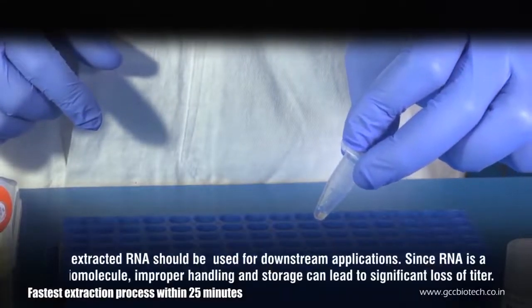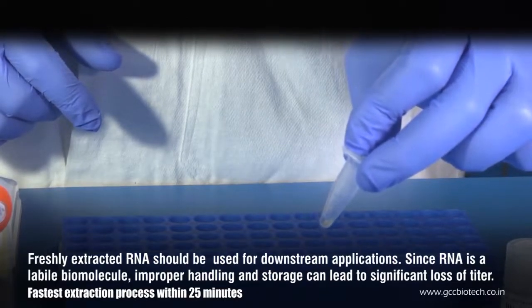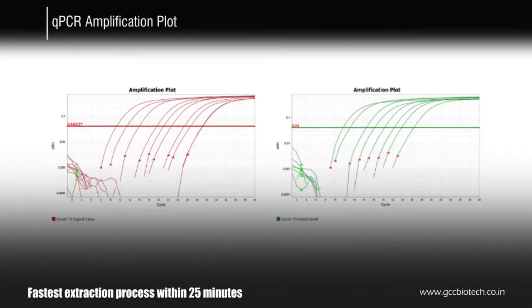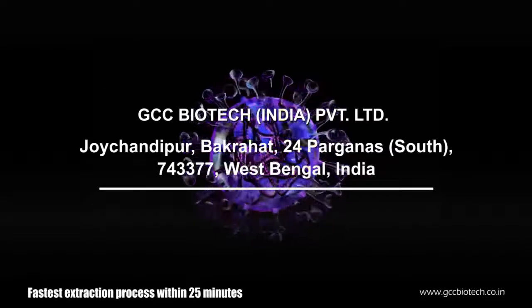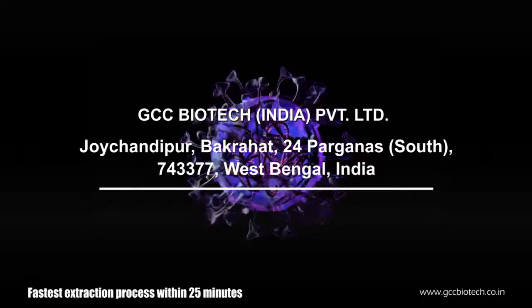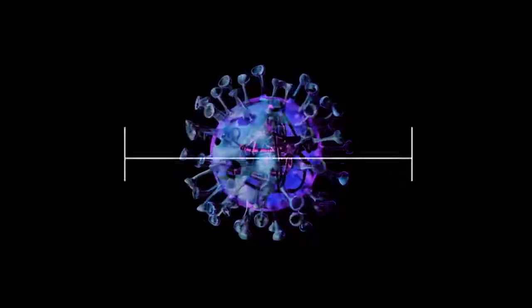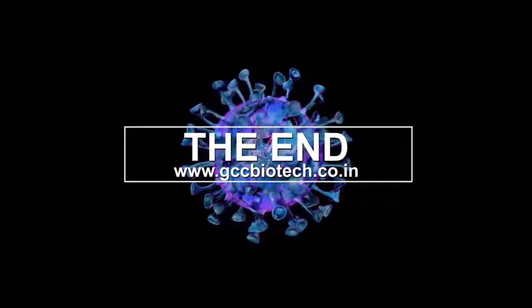Discard the column and your RNA remains in the eluate in the microcentrifuge tube, ready for further downstream applications. For further information, log on to www.gccbiotech.co.in.